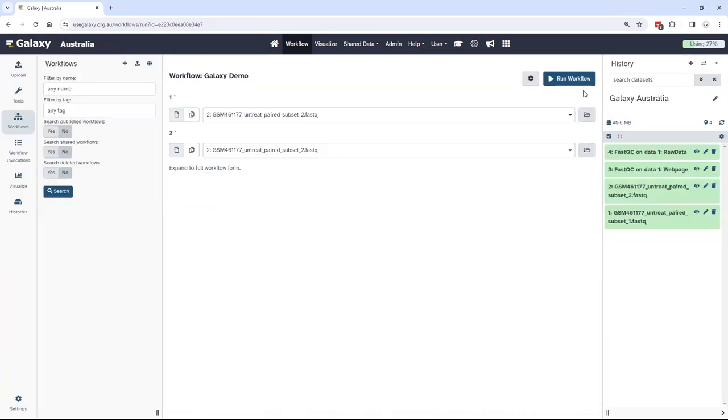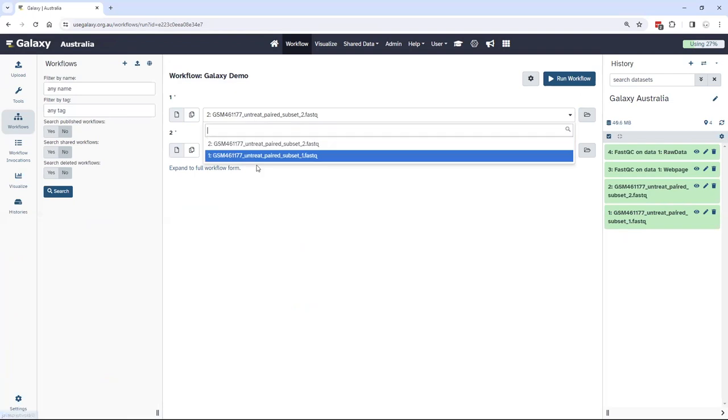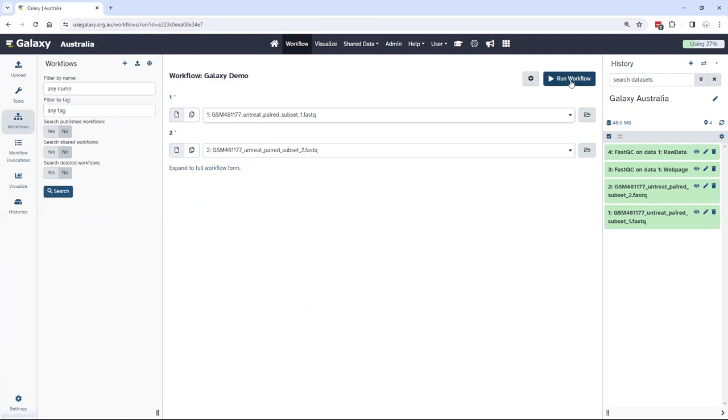I execute this by running the workflow, selecting my inputs appropriately, and clicking run workflow.